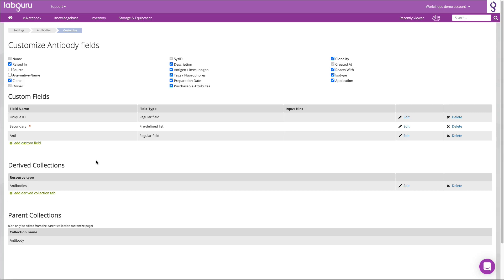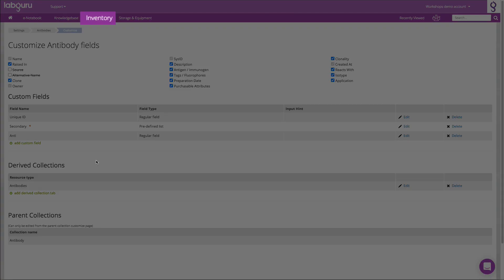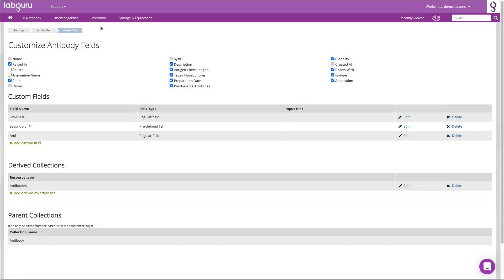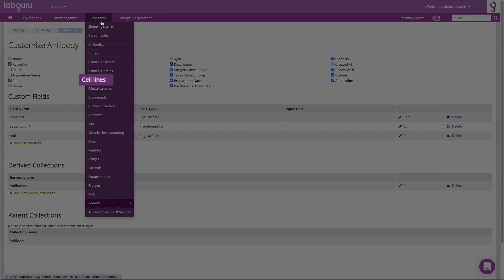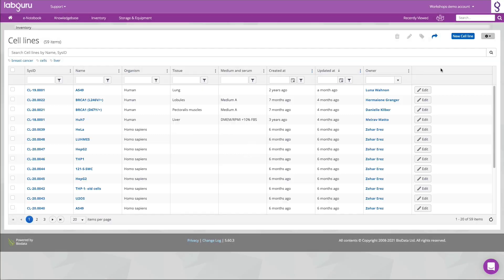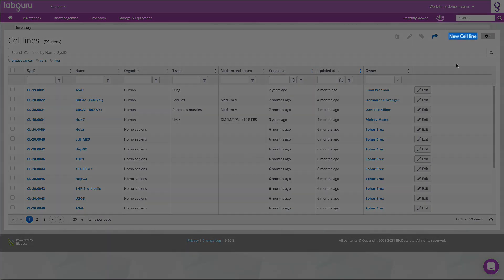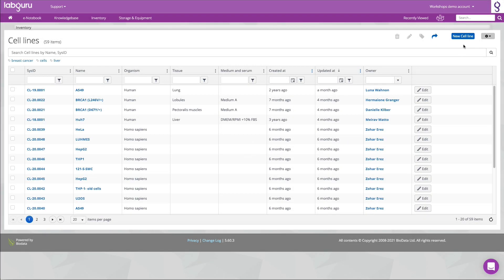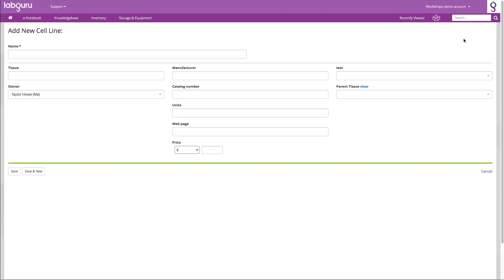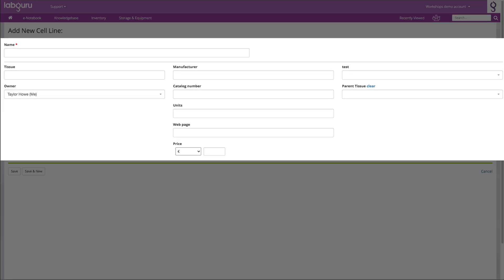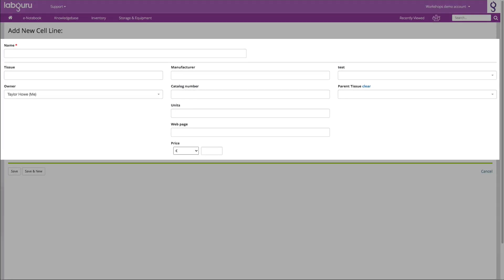The next step is to populate the collection with your inventory items. There are two ways to add items to a collection, and the first one is to add items manually. Fill in those fields and make sure to click save.